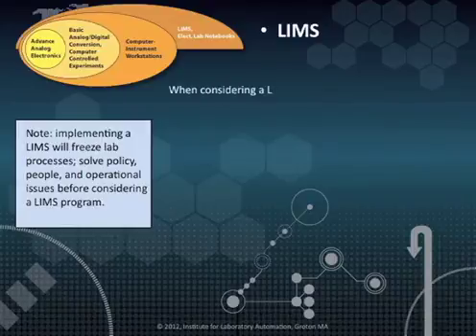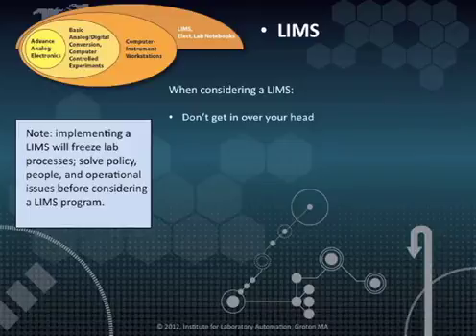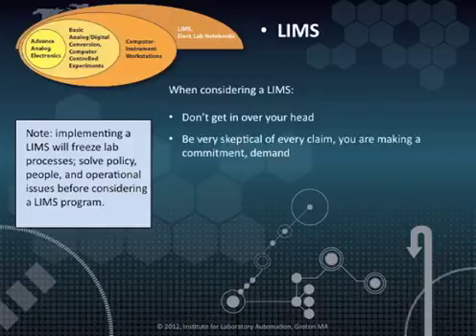When considering these types of products, be careful of getting in over your head. These are expensive systems and take a lot of planning to put in place. If necessary, look for consultants that can help you. Be skeptical of every claim the vendor makes. Ask for proof of the claims and ask for reference sites that demonstrate the points the vendor wants to make.